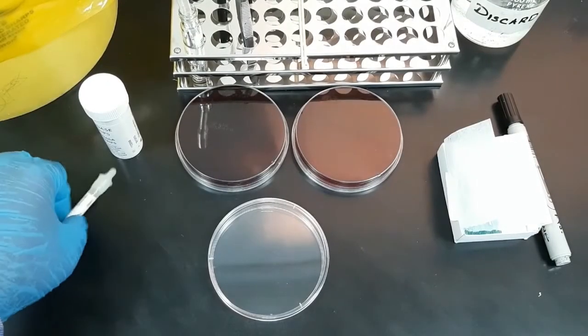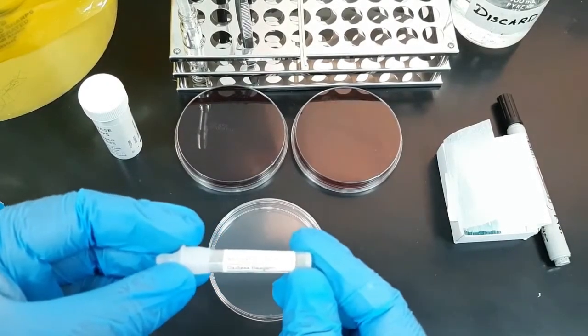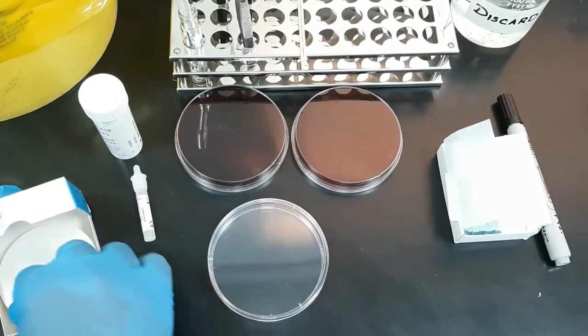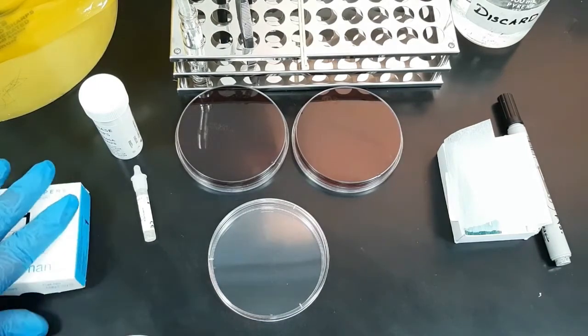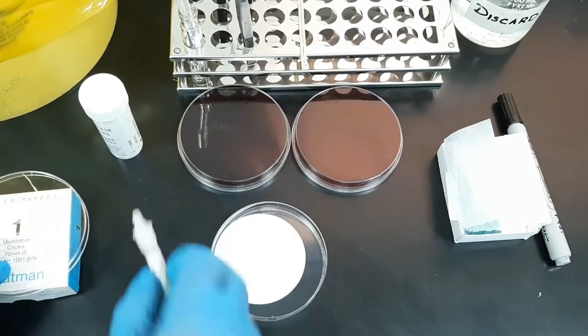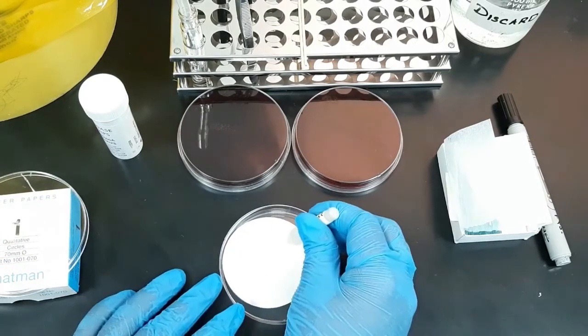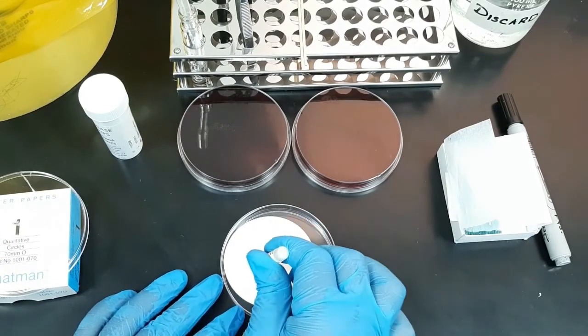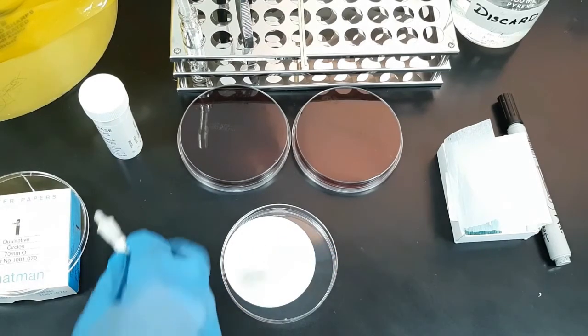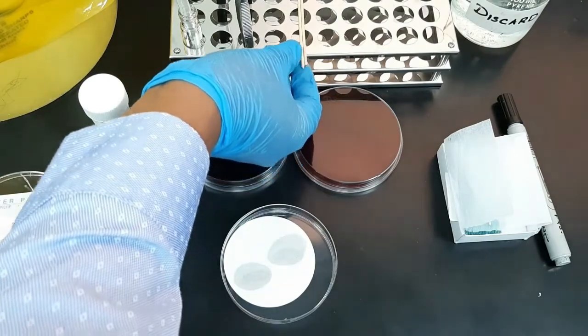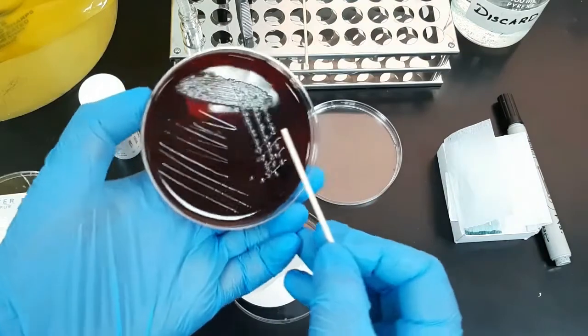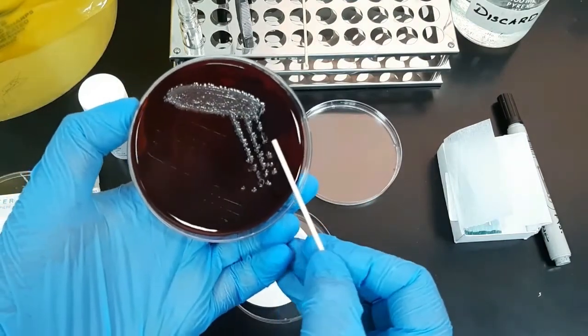Now I am going to show you another method using oxidase reagent. First, place a piece of filter paper into an empty petri dish. Transfer some drops of the oxidase reagent to two sides of the filter paper. Then pick the bacteria from the culture plate with a sterile wooden stick and rub the sample onto the oxidase reagent on the filter paper.